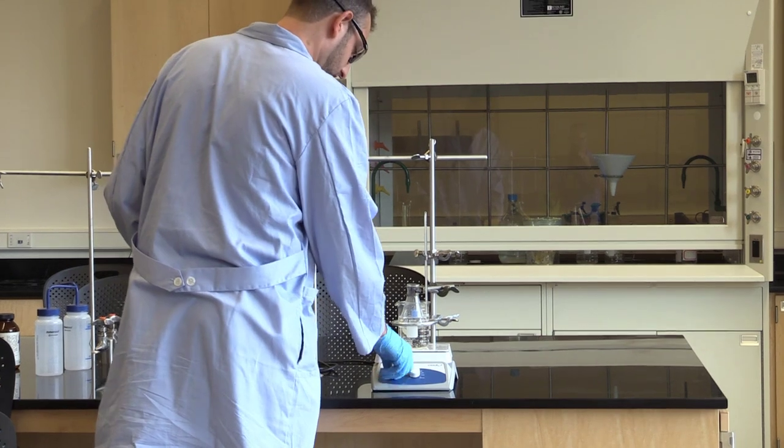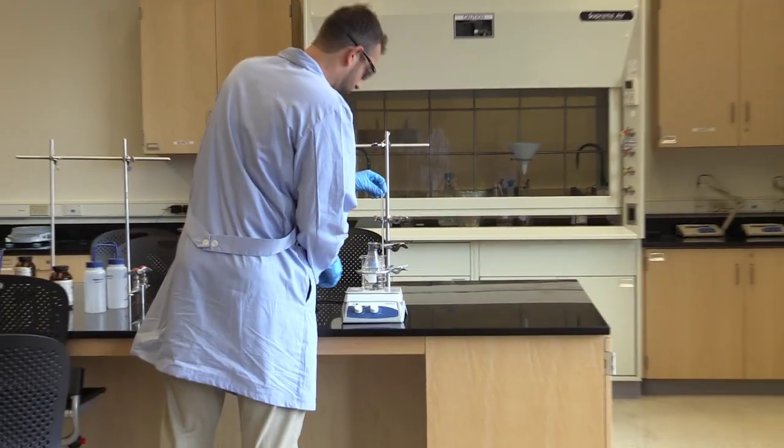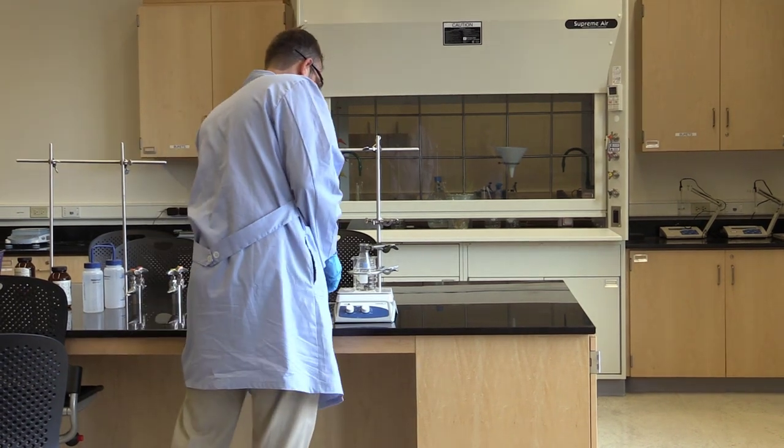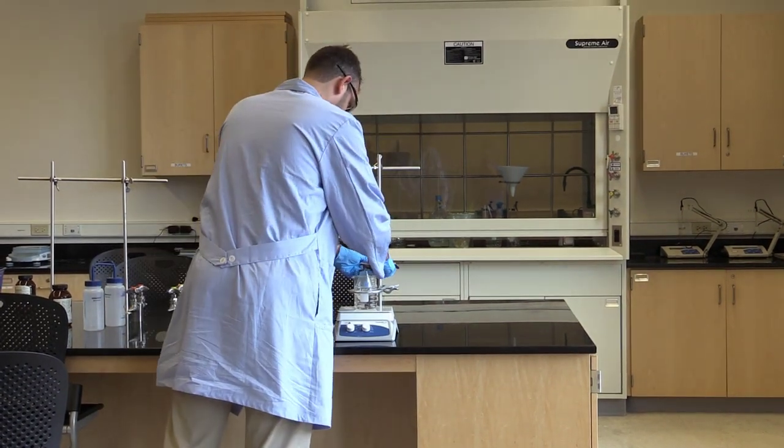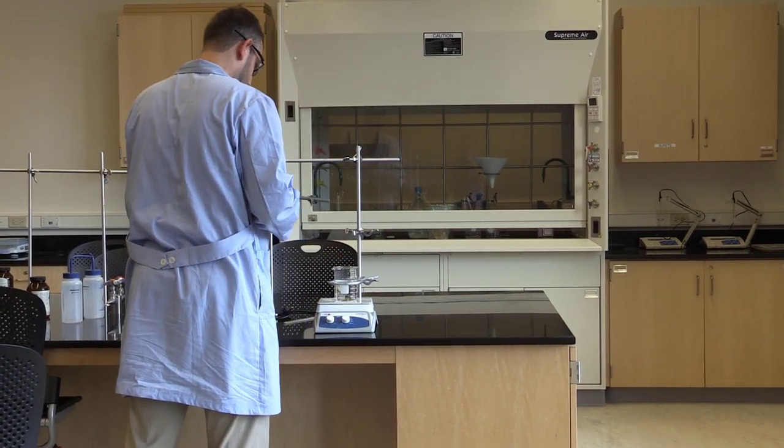The first thing we'll do is turn off the heat and unplug the hot plate. Next, we'll remove the thermometer so we don't break it as we take out our sample.